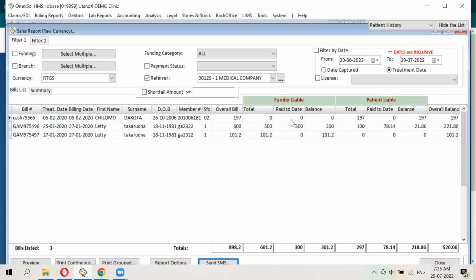Yeah. Because right now I'm using a local server, and when there are power cuts, it's a challenge, because the other guys far away, they're 1,000 kilometers away, they can't operate. In fact, everybody can't operate when the server is down. Right, right. So we had to start investing in backup power. It's been really costly, and it's a challenge.